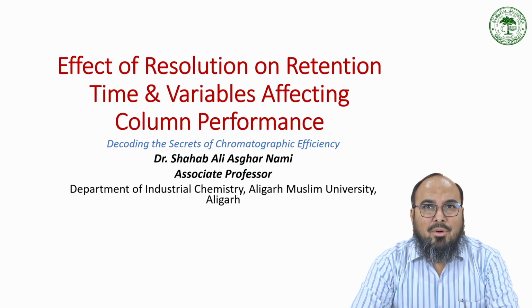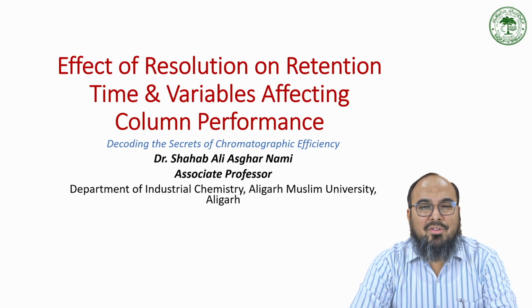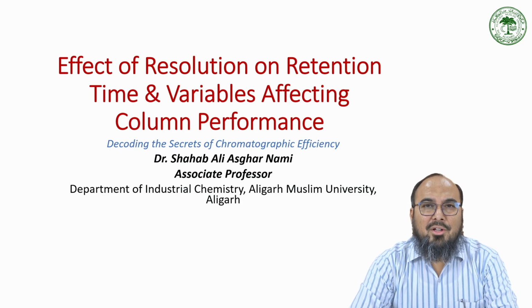So we were discussing chromatography, that is unit 3 of this Advanced Analytical Techniques course. We have already discussed the principle of chromatography, various fundamental terms arising in it, and we have also discussed the column performance and then optimization.